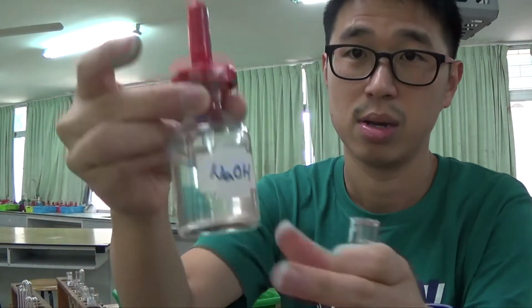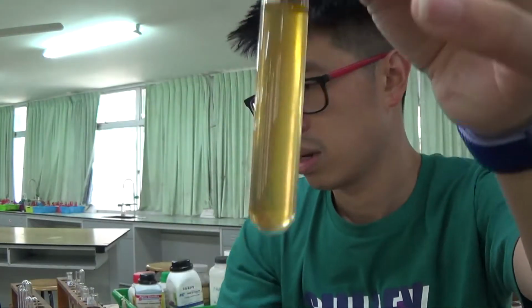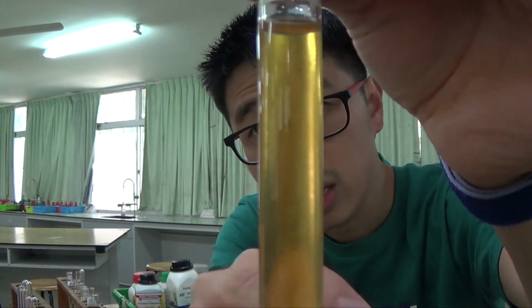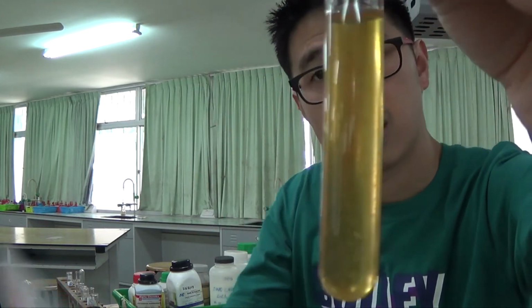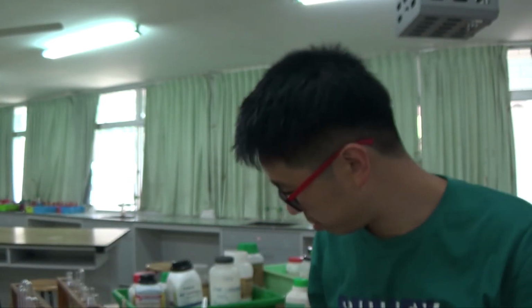Actually I have another bottle of sodium hydroxide, Na+, OH-. I could just add more, and they do not go away. You see there's a reddish brown suspension. So this is telling you that the precipitate is insoluble in excess NaOH.